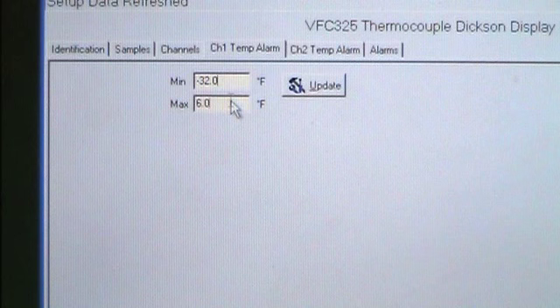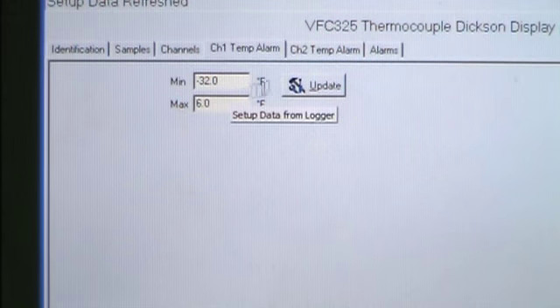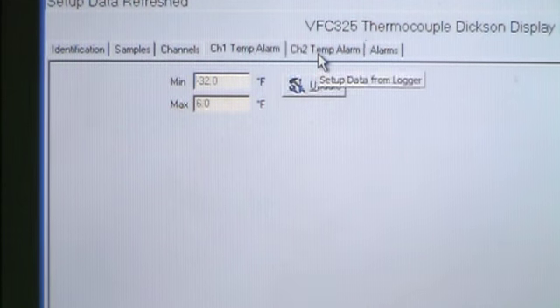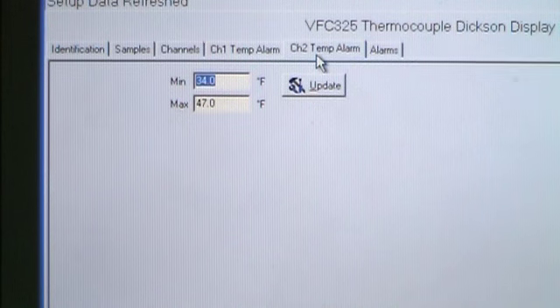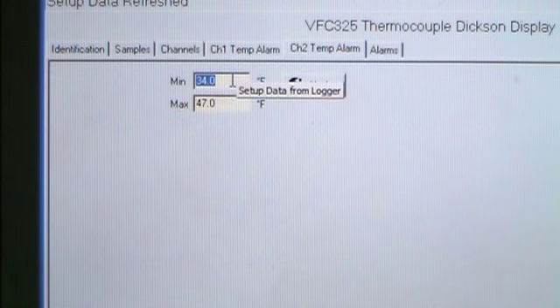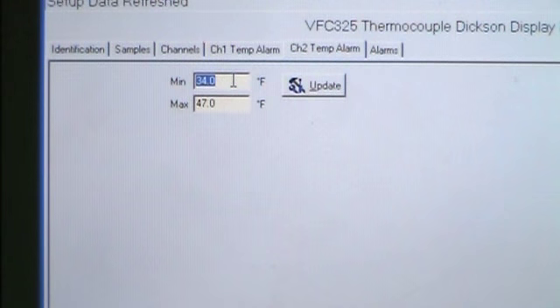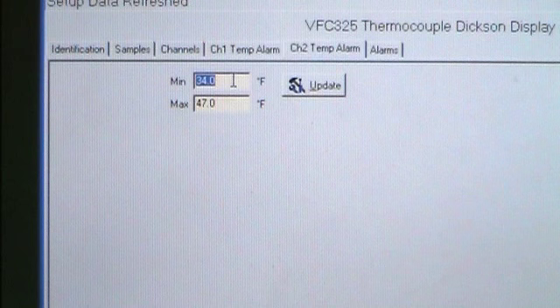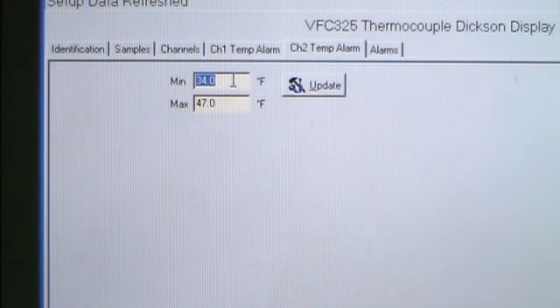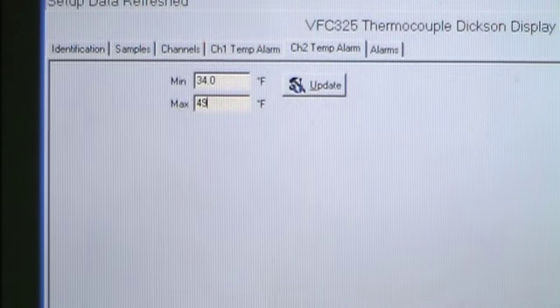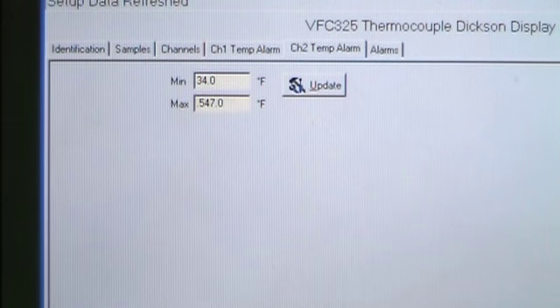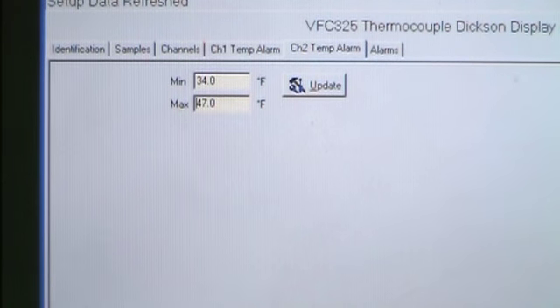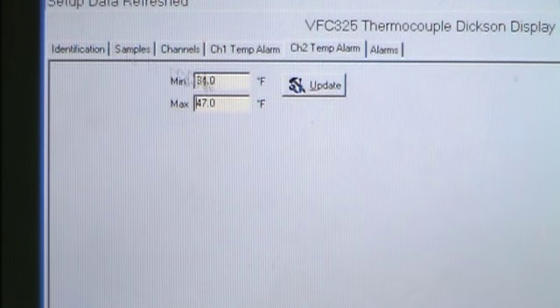Choose the Channel 2 Temp Alarm tab to set the Min and Max alarm conditions for Channel 2. For the VFC325, the alarm defaults are Minimum Temperature 34 degrees Fahrenheit and Maximum Temperature 47 degrees Fahrenheit. As with Channel 1, to make any changes, type in a different temperature and click Update.